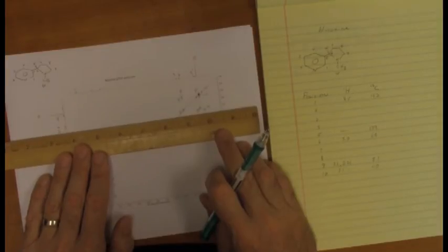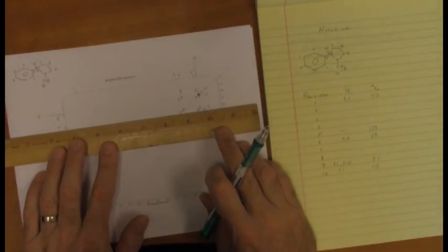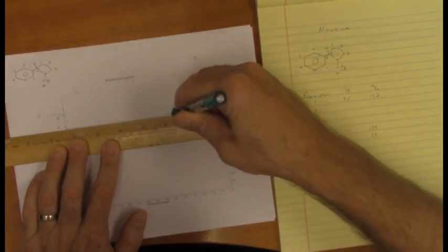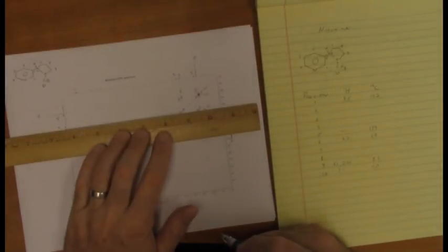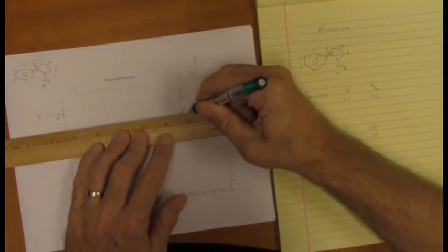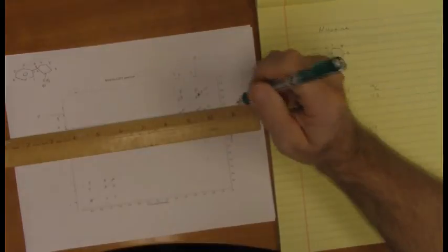Because what I'm going to do is look for cross peaks at position 9. And the clearest one I think is this one, not 9 prime, but 9. And here we go. I come out from position 9 and I hit the diagonal. There's the peak on the diagonal. Remember, peaks on the diagonal are nice, but there's no real information in them. So I'm going to kind of ignore that and continue out until I come to an off-diagonal peak. And there it is.